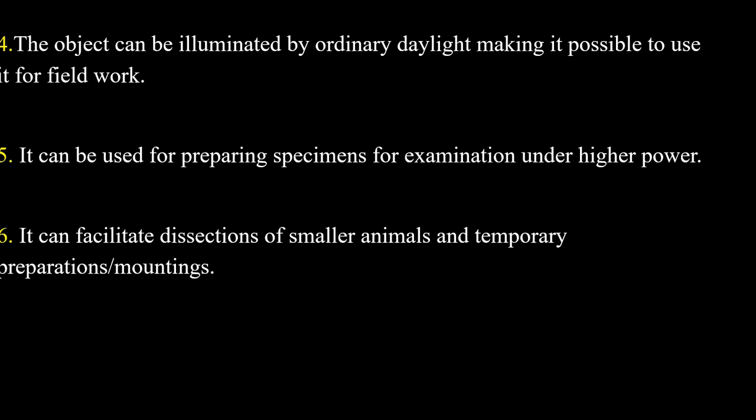An object can be illuminated by ordinary daylight, making it possible to use it for fieldwork. It can be used for preparing specimens for examination under higher power. It can facilitate dissections of smaller animals and temporary preparations or mountings which are required during biological study.